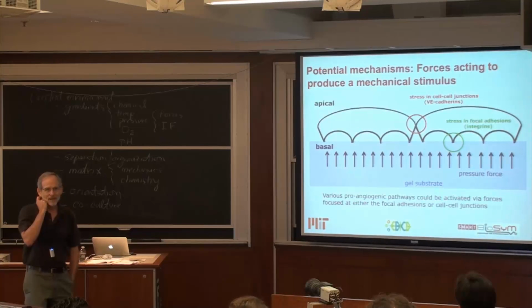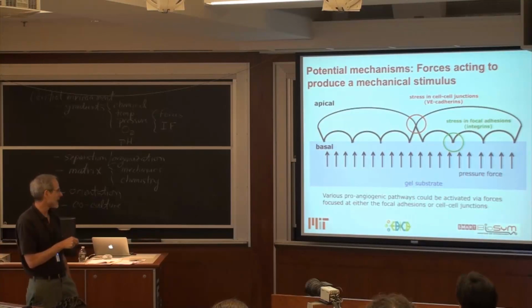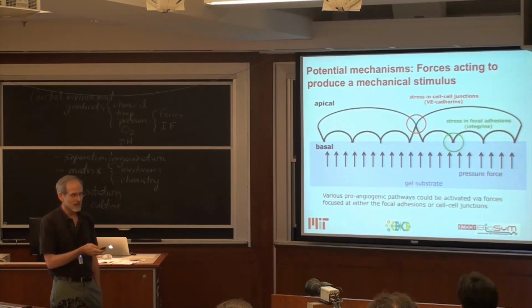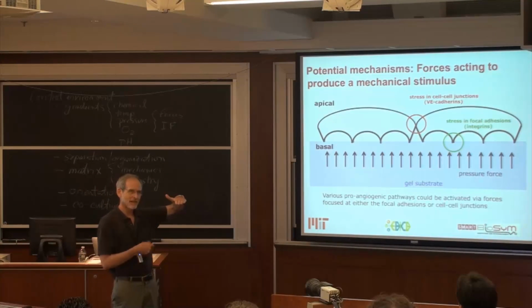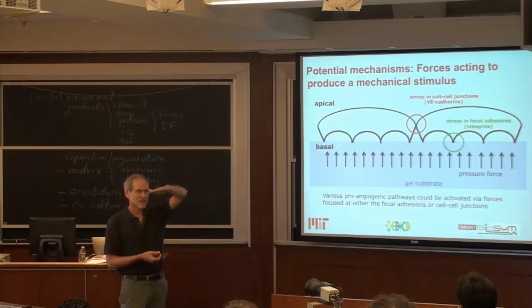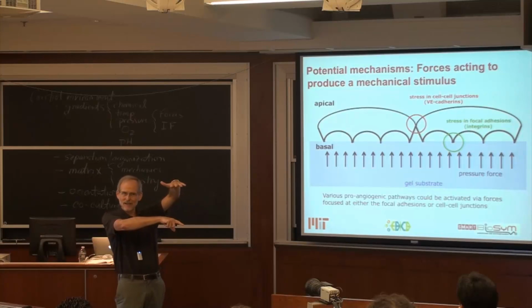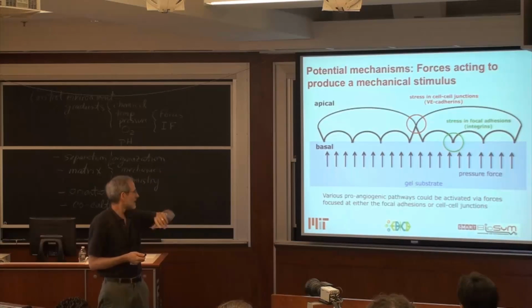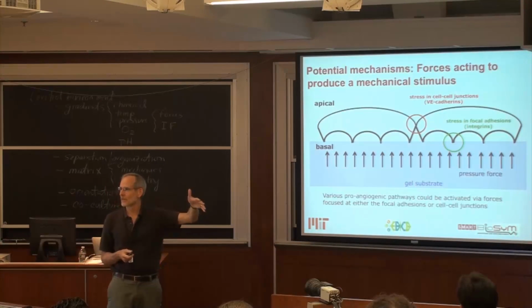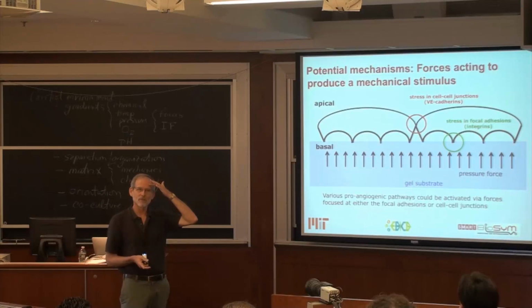So we thought, well, in the system we can start to probe the mechanism by which this is actually happening. We first thought that, due to the flow, we're probably setting up some sort of polarization of any growth factors that might be in the medium. Because if you've got a barrier here, you're going to get a pileup of protein on the bottom side of that monolayer, and that could be a gradient that could give rise to polarization and might induce growth. But then we just flooded the system with VEGF, this vascular endothelial growth factor, and got exactly the same response.